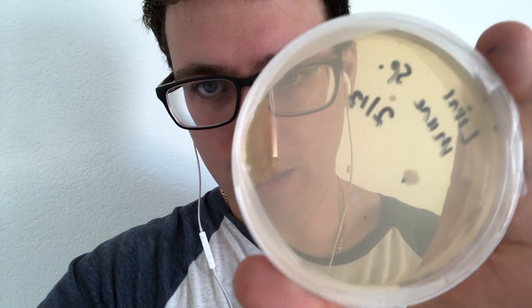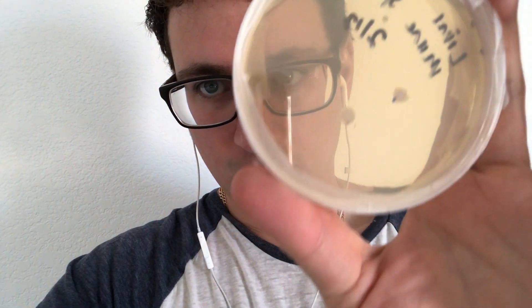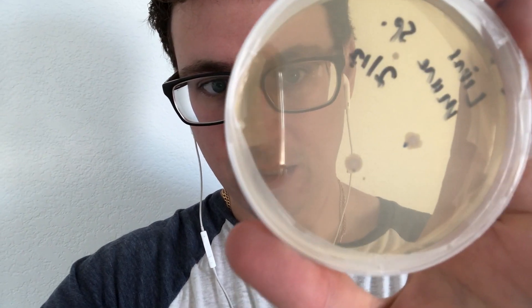They're kind of filamentous, so it might be a Bacillus bacteria. Don't be fooled — that's not mycelium.